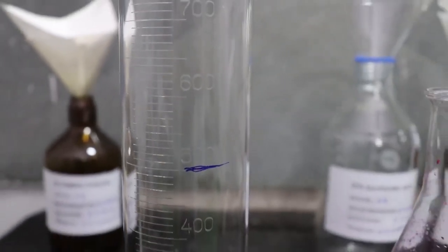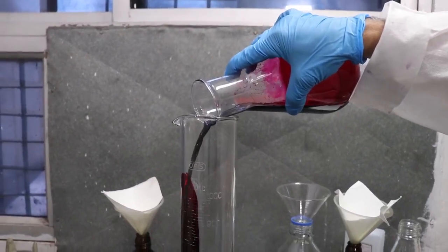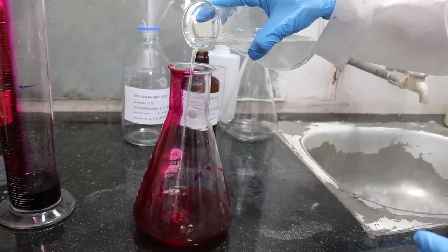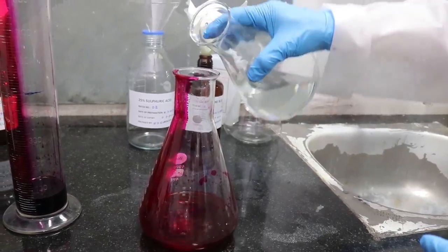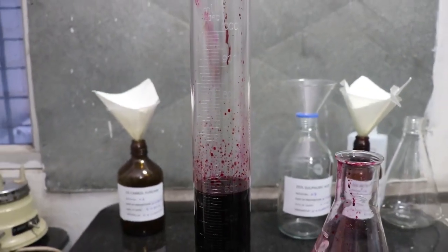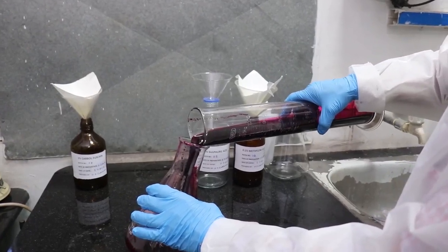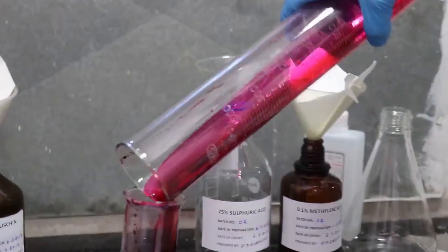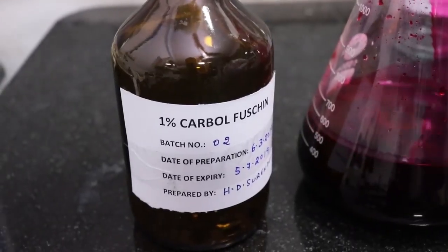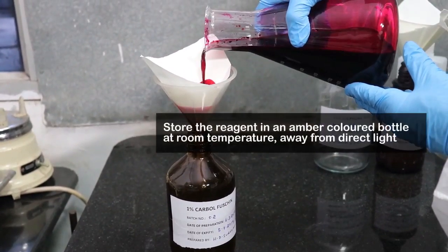Once completely dissolved, make up the volume to 500 ml by adding distilled water. Filter and pour into a clean and labelled bottle. Store in a cool place away from direct light.